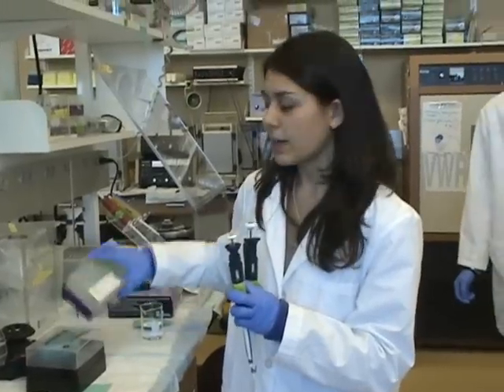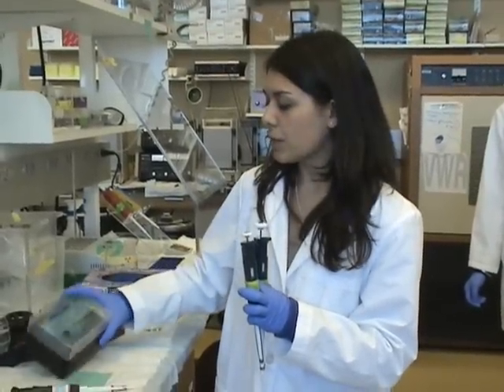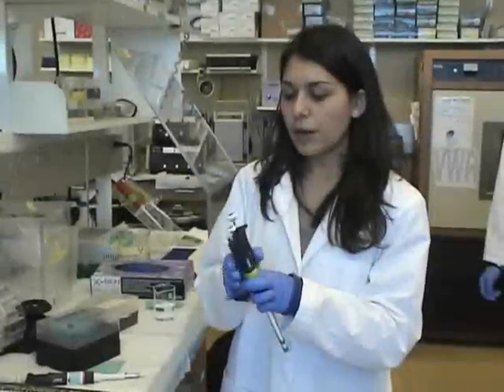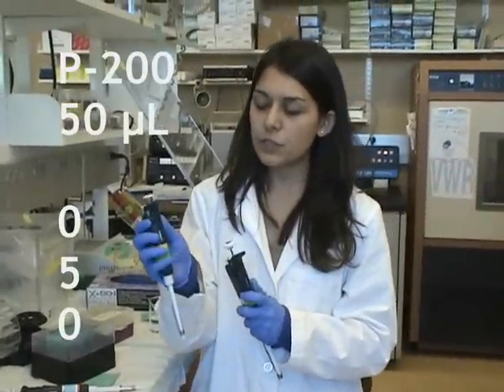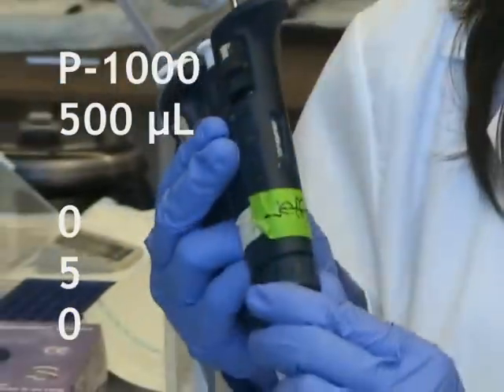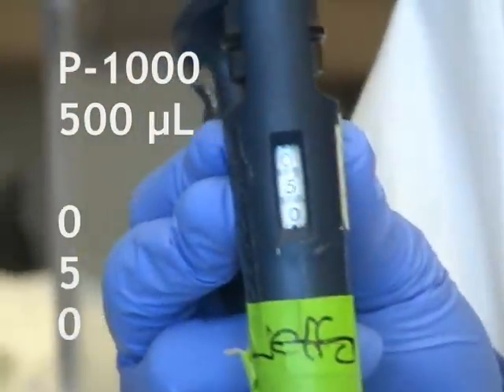The last two micropipettes I wanted to go over are the P200 and the P1000. For the P200, you still use the yellow tips. And then for the P1000, you switch over to the bigger blue tips. If we want to set these — the P200 is set at 50 (0, 5, 0), and the P1000 is set at 500 (0, 5, 0).